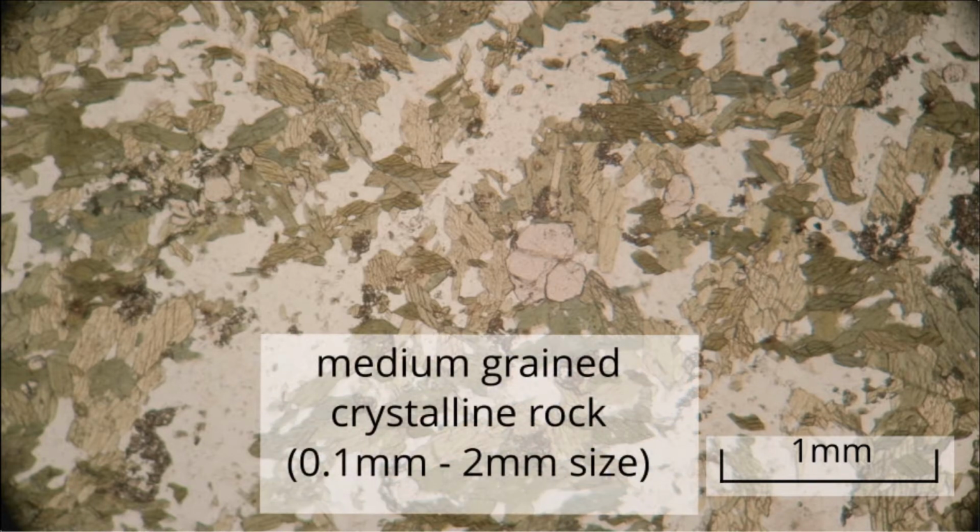Most of the grains are between 0.1 mm and 2 mm in size, so the rock is described as a medium-grained rock.